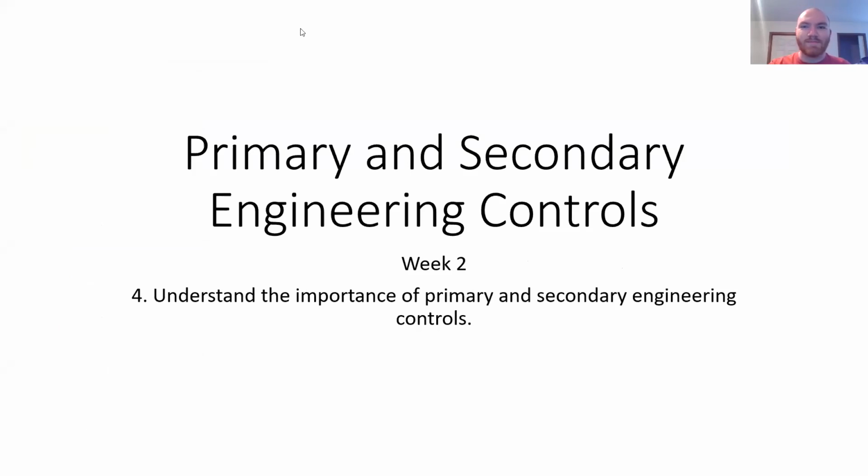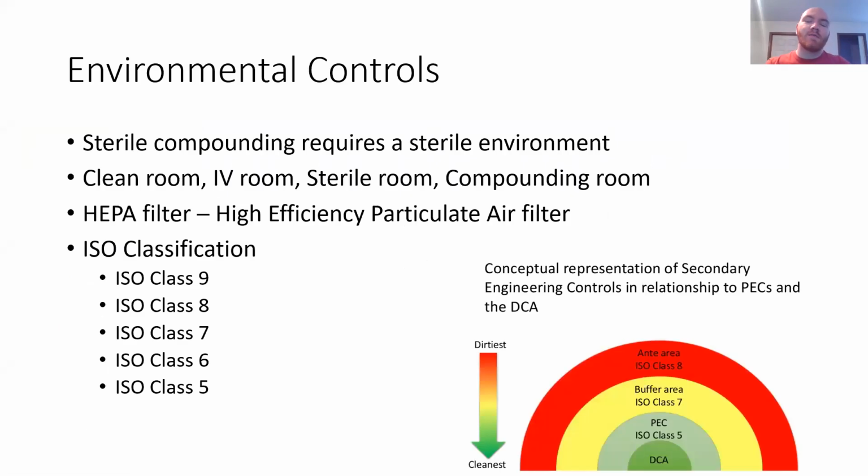There we go. So environmental controls are an important part of sterile compounding because no matter how good your technique is, if you're not in a clean environment, your preparations will not be sterile as well.